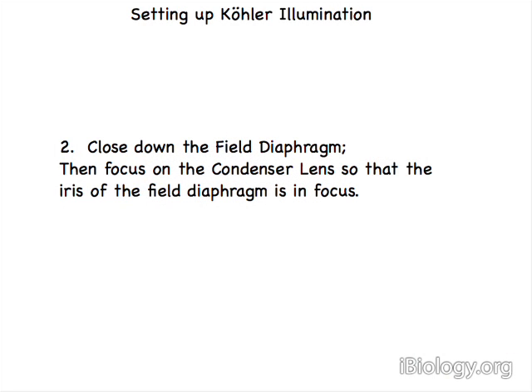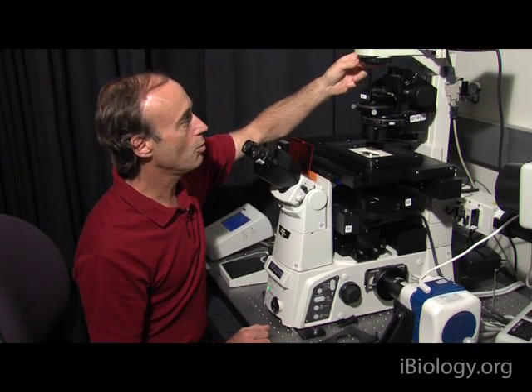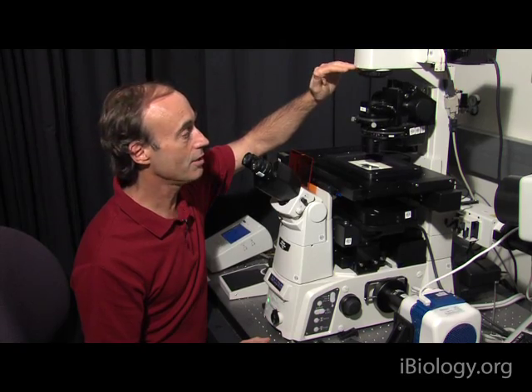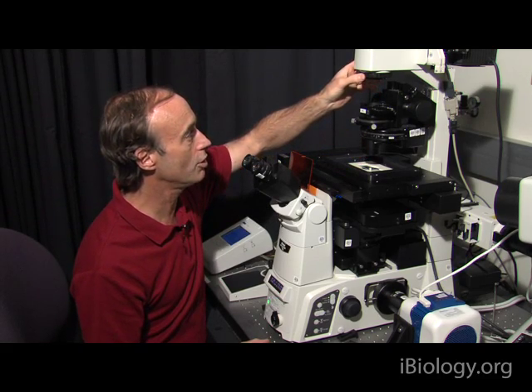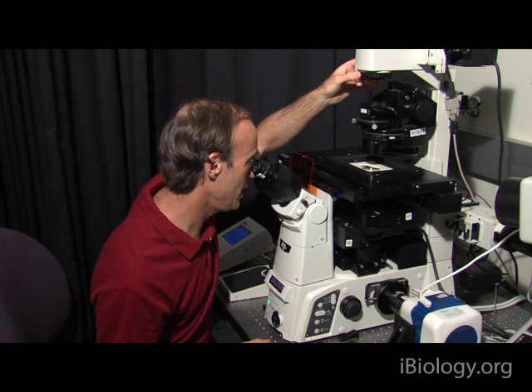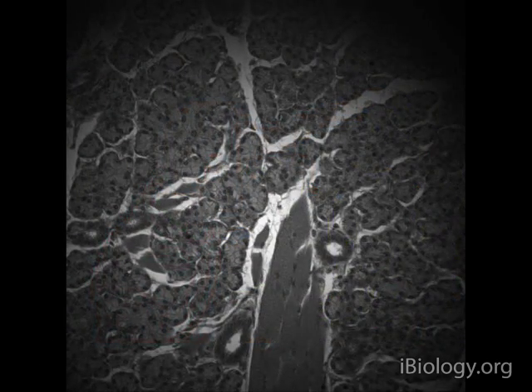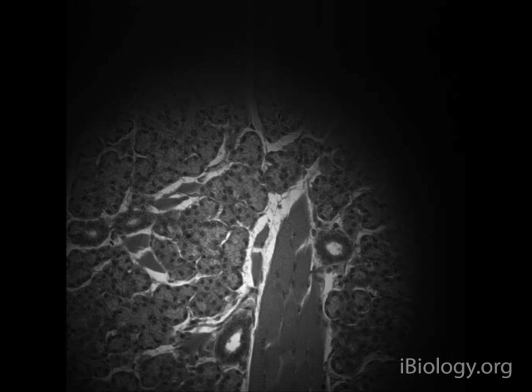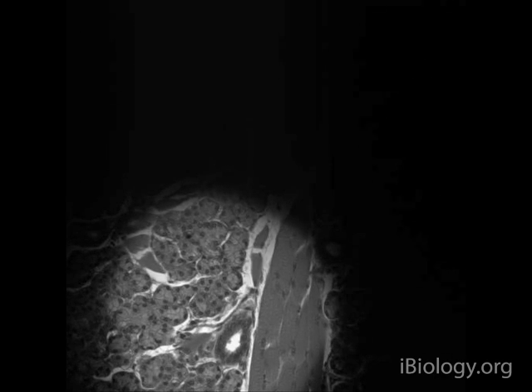The next step is to adjust the condenser lens to the right position. I know it will be in the right position when the image of the field diaphragm is in clear view in the specimen plane. So first I'm going to close down the field diaphragm. Initially I can't see it at all. Now I'm going to adjust the condenser lens — I'll bring it down — and I can see the image getting brighter and brighter, and I can see the edges of the field diaphragm come into focus. There it is. That's the second step of Köhler illumination.